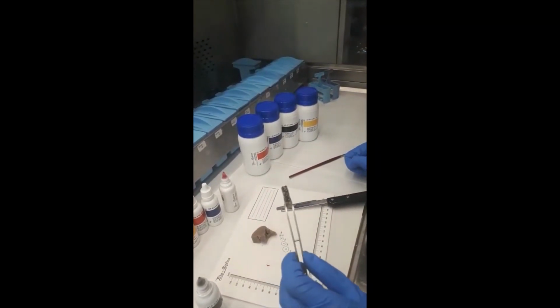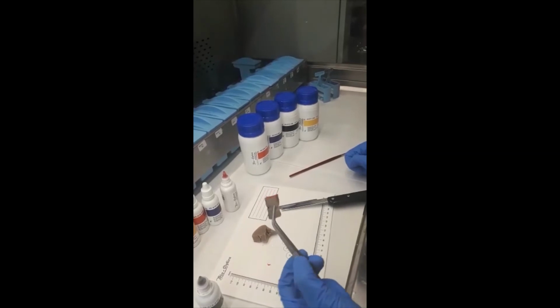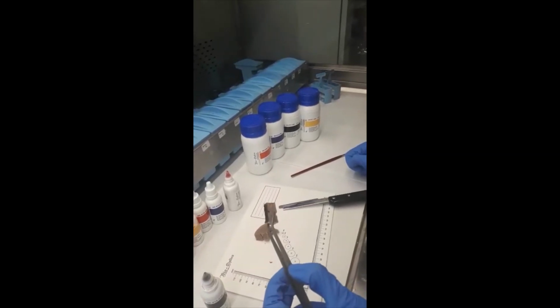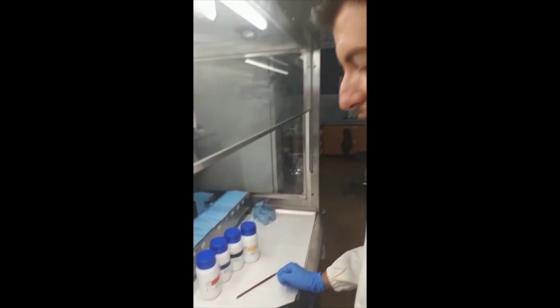Then we can let it dry, and after 3 minutes we can put it in formalin if we have to fix it again. Otherwise we can put it in the tissue processor for tissue processing. After this phase we can proceed with the embedding of the blocks with the margins, and at the end the result will be this one.